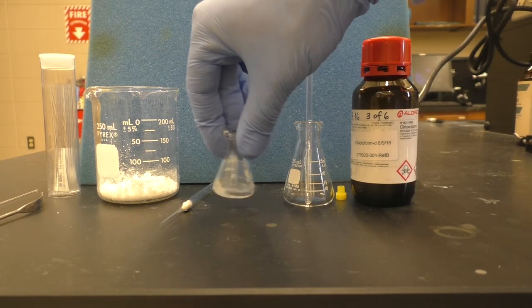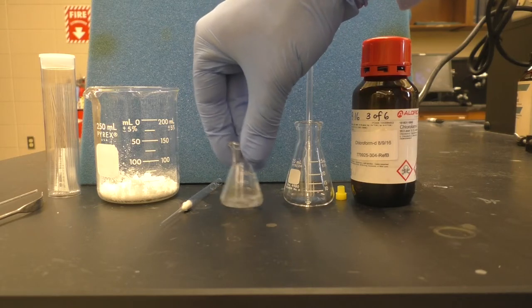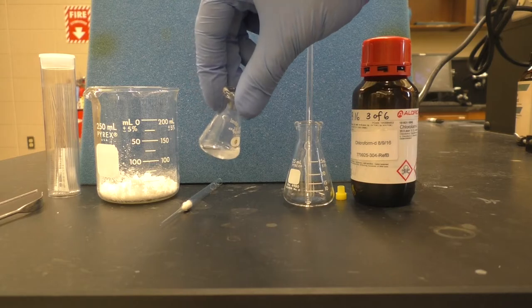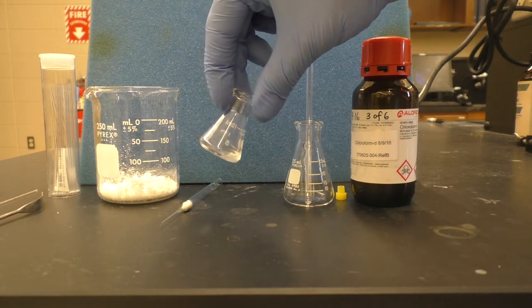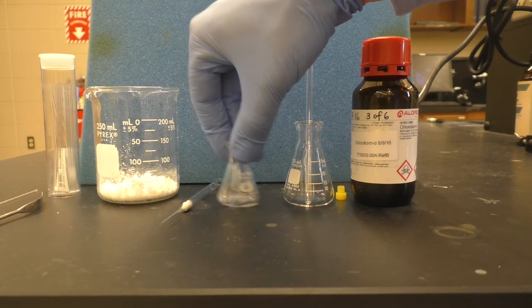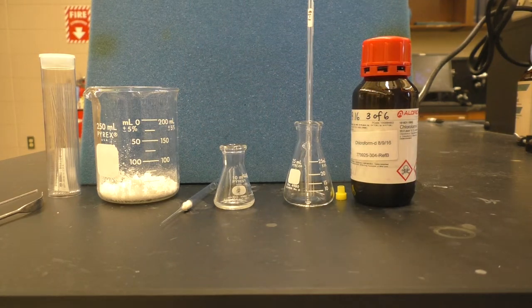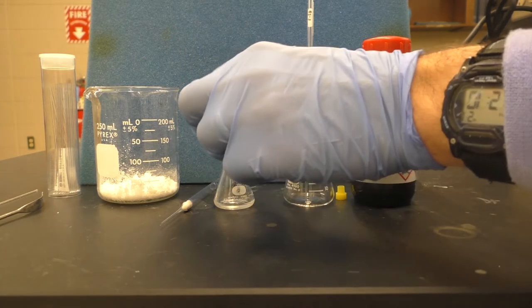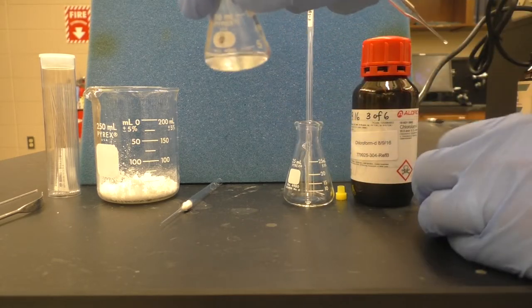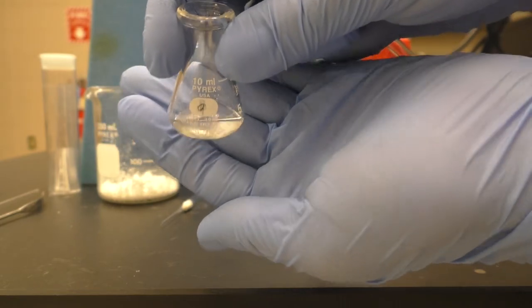So I'm going to swirl this around, try to get everything dissolved. It was actually relatively clear. Not 100% dissolved, but most of that material seems to have dissolved. And so the very small amount of solid material remaining, I won't worry too much about. It'll be all right if that gets into the NMR tube. You can see the vast majority of the material is soluble.